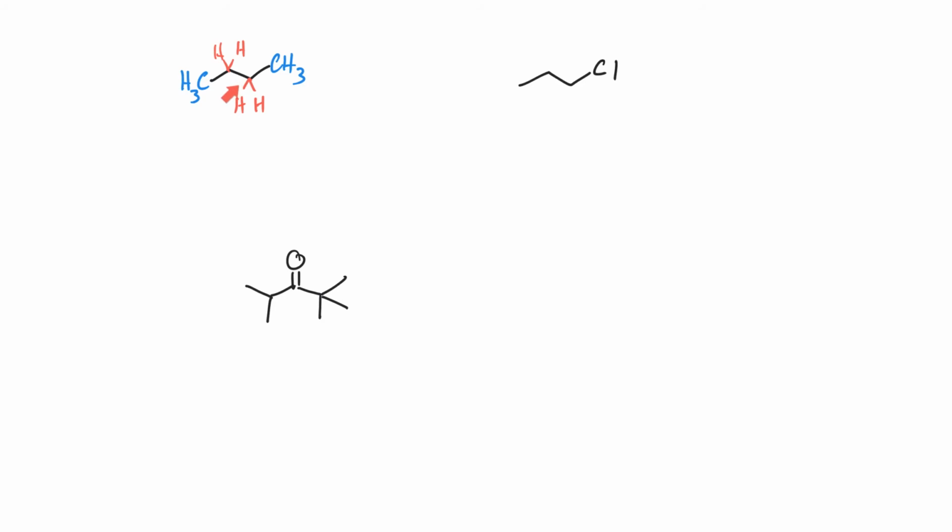And so when we look at this CH2, we expect it to have 3 nearest neighbors, and thus it should be a quartet. So 3 nearest neighbors, 3 plus 1 equals 4. Let's look at the methyls then. The methyl groups are equivalent, again, by symmetry, and of course they have undisputably only 2 nearest neighbors, the CH2s. So for the methyl groups, we would expect n plus 1, 2 plus 1. We would expect a triplet for that signal.